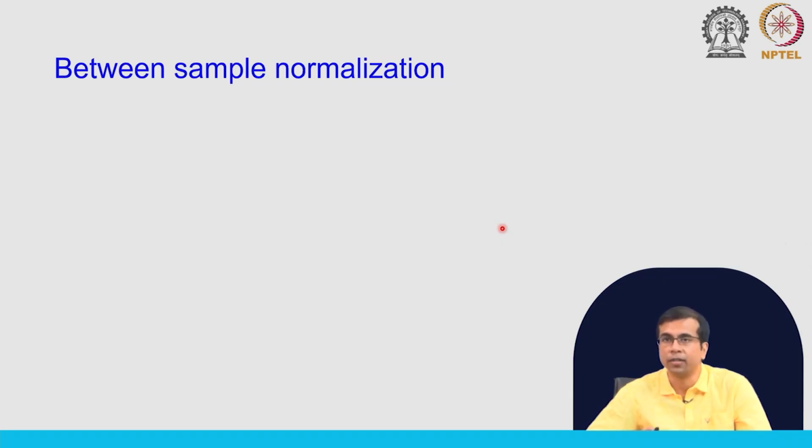So, we divide by the gene length and also by the sequencing depth. This is within-sample normalization, and we are not comparing across samples within a data set. This becomes very important in many analyses that we do.